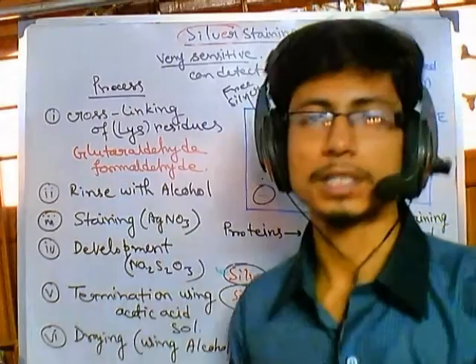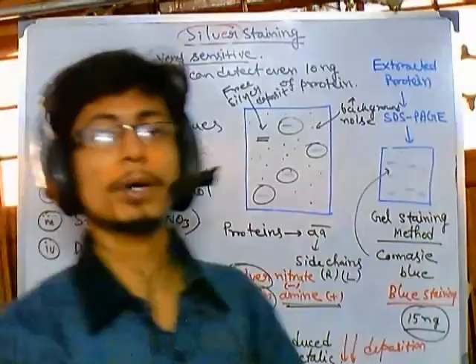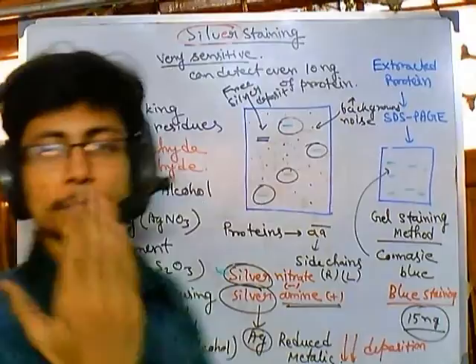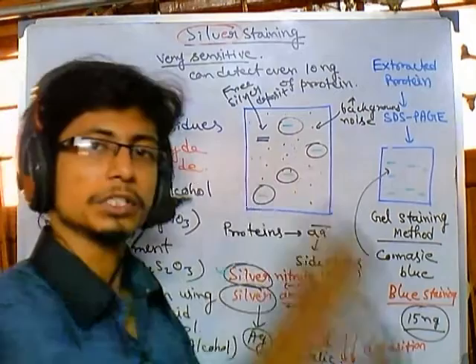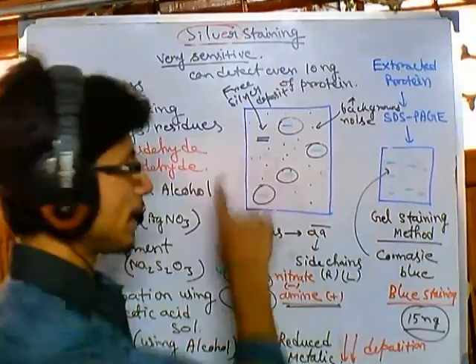So we can take this gel, take pictures, and measure the presence of these proteins. But another important concept: once we deposit this silver onto these proteins and obtain the gel, we cannot do anything further with it, because we need to discard this gel. Removing the silver from the protein and getting the protein back is an extremely tedious task. So that is a disadvantage of silver staining.